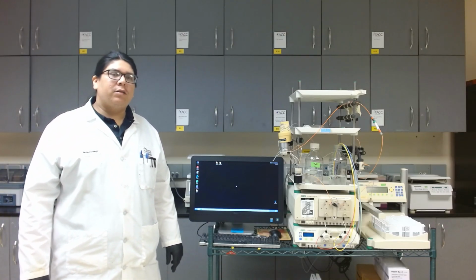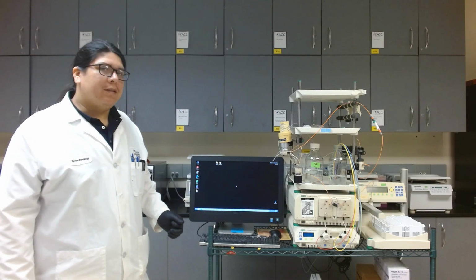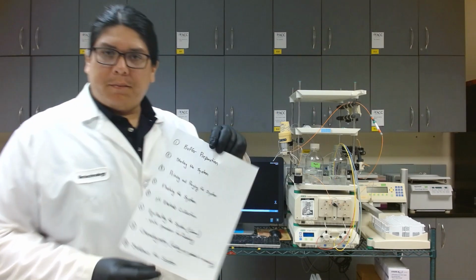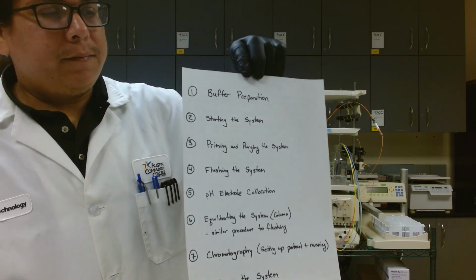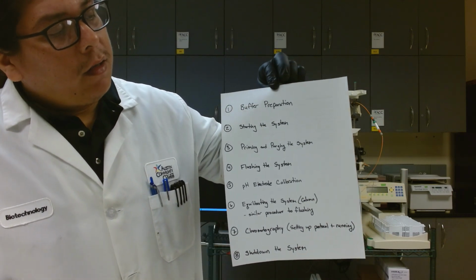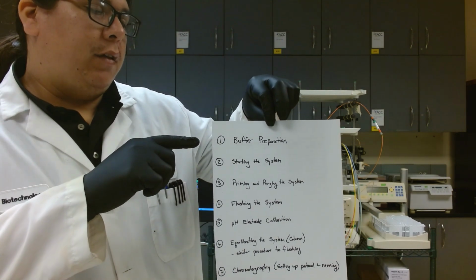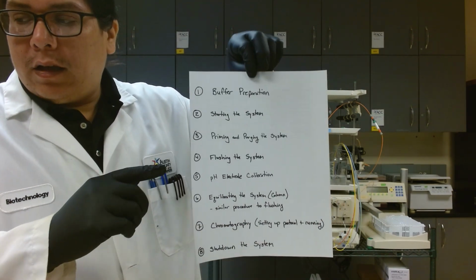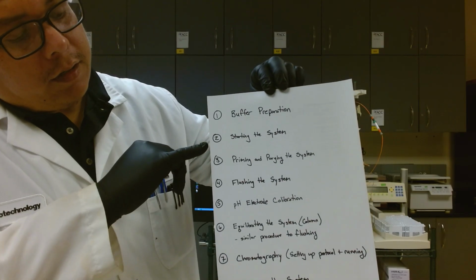I'm with the Department of Biotechnology at Austin Community College, and today I will be reviewing with you the general operation of the Biorad Duoflow FPLC system. There's 8 basic operations that we're going to review, some in more detail than others, but we're going to start with the buffer preparation. I'll give you a quick overview of that and how, once we make our buffers, you'll want to filter and degas them. And then we'll show you how to start the system.